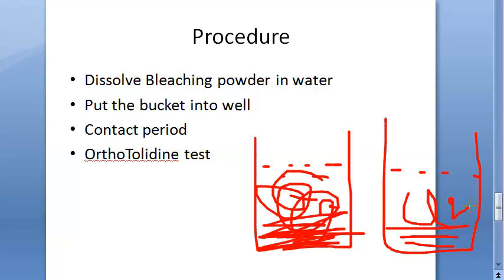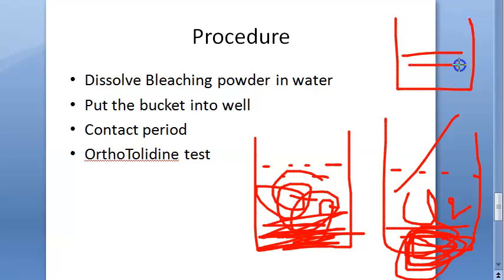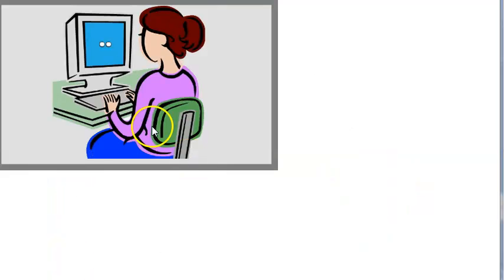So you will take the solution only and transfer it to another bucket. And whatever is there down, this chalk kind of thing, chalk lime, you will discard. So you will take only the water, guys. Please pay attention here. You will take yet another bucket and take only this chlorine water. This is something very important. You will not just put the bleaching powder. You will actually take this chlorine solution, put it in a bucket, and discard the chalk lime.